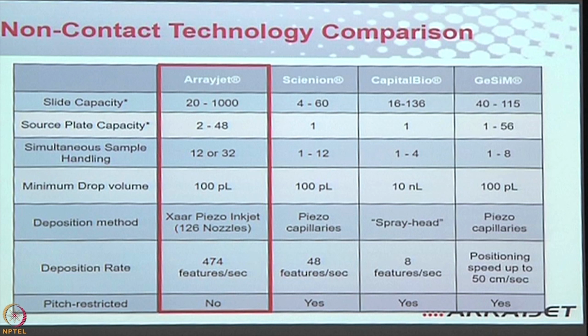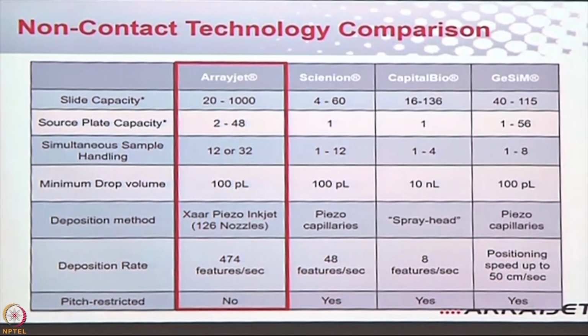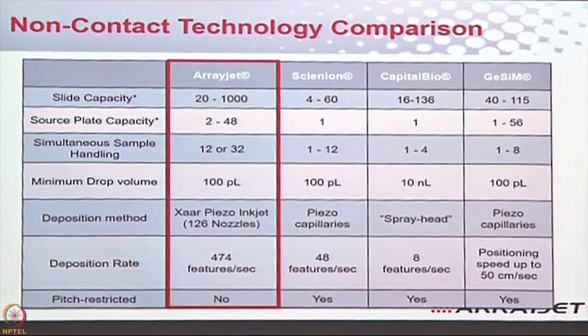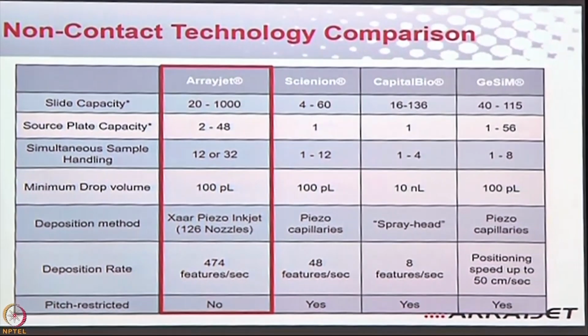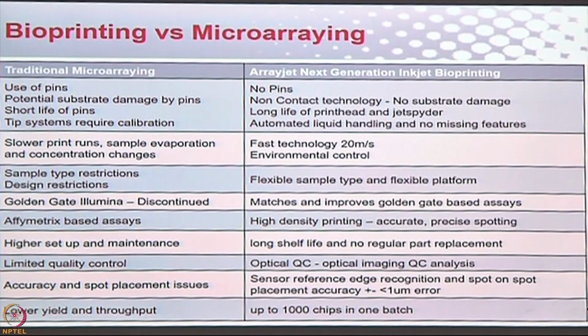Again, this is something that people have asked me in the past is, so are you the only ones or are there other people? So I thought I'll show it to you, to make you see the difference in what is the edging effect here. They're all non-contact, so nobody uses pins. We're all using this printhead mechanism, but there are large differences in how we can handle each and every sample. I'm going to go back.